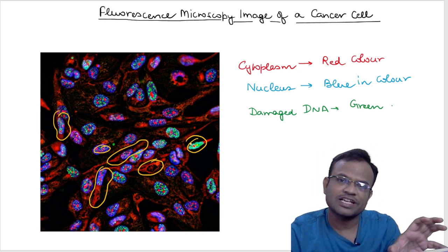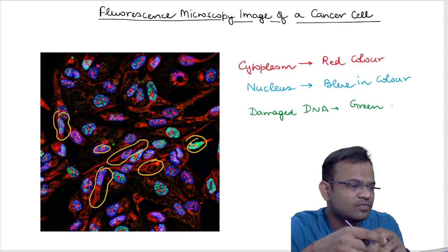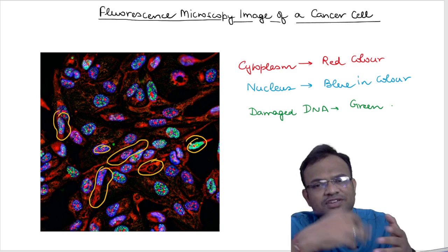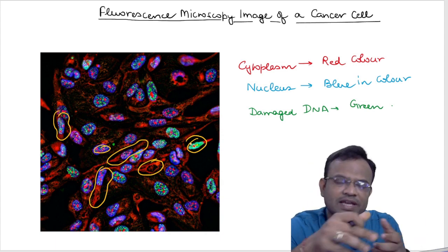Right? So this was the explanation of the entire fluorescence microscopy. At times I have seen that they ask Stokes shift in the examination, they ask fluorescence microscopy principle, they can ask you the relationship between energy and lambda. Of course, they won't ask you directly, but yes, in indirect ways they can ask you. So I hope this topic was clear to you.